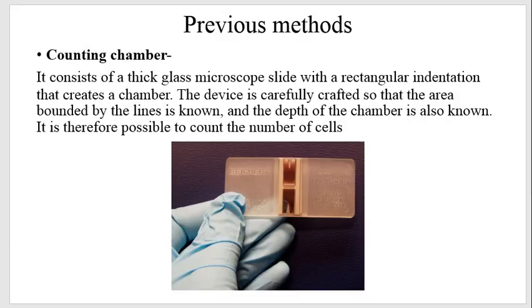There is a hemocytometer, also known as a Neubauer chamber, which has a fixed size grid. A Neubauer chamber is raised to a height where it can fit only 10 microliter of blood when you put a cover slip onto it, and its height is so precisely adjusted that only one cell lies at a time, so that there is no overlap of cells on a focusing plane. That focusing plane is further divided into specific grids. These grids allow us to calculate the volume. Generally each grid will have 1 nanoliter of volume, depending upon what grid size I am talking about.